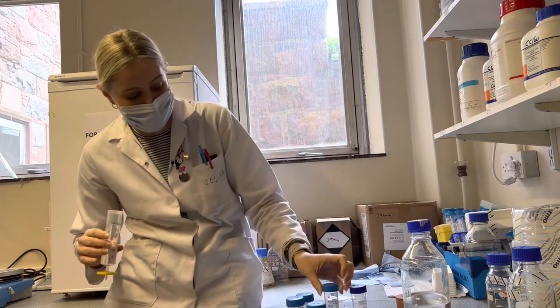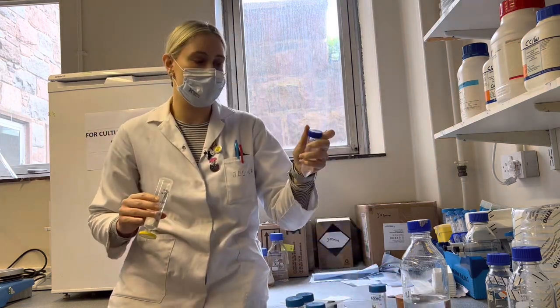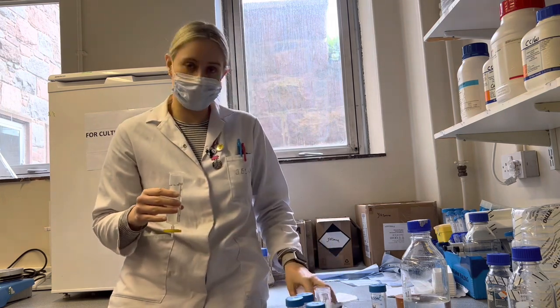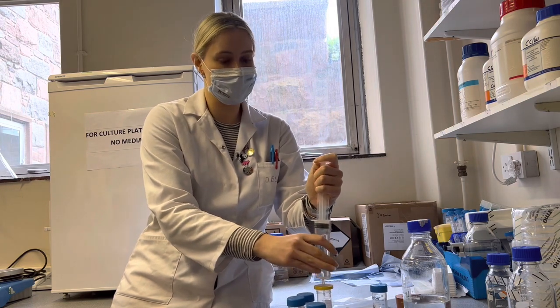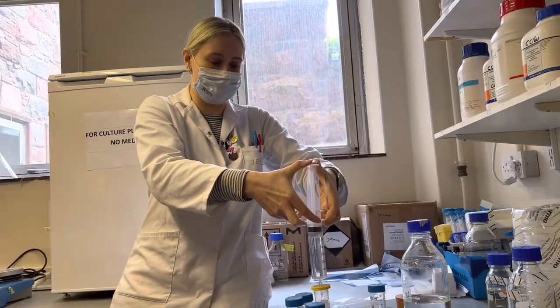But today is bioassay cell washing day, so that means the bioassay has run its course, and I get to wash all of the wells, and tomorrow we will get the data for the bioassay. So we have to keep our fingers crossed that everything has gone to plan because this is a really, really important study for my PhD.